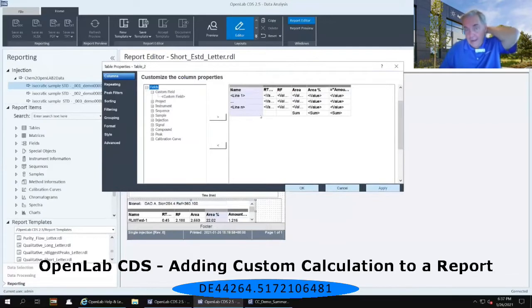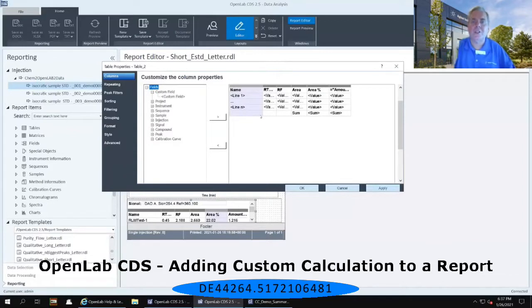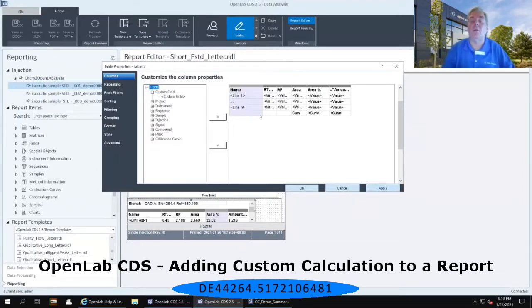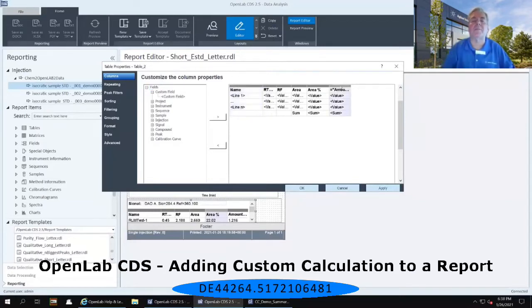Now, for this example, I want my custom calculation, that USP pass fail column, to be the final column in this table. So I'm going to click my last column in the table right now, and that's going to highlight in a little bit of a purple hue color.